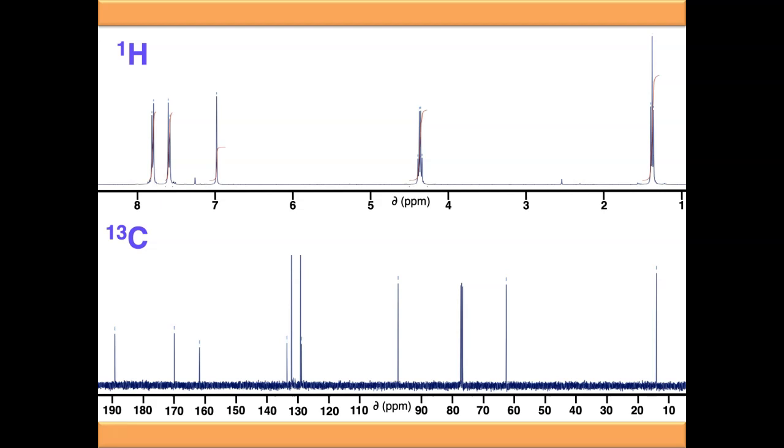On a carbon NMR, the scale is much longer, between 0 and about 220 ppm. You'll also notice most signals in a carbon NMR don't have any splitting—they all appear as singlets, whereas in proton NMR we see signal splitting. You'll also notice that on carbon NMR, you don't get the integrated trace like you do on proton NMR.